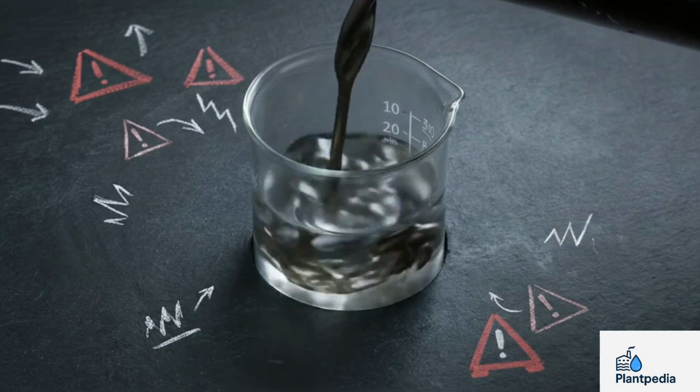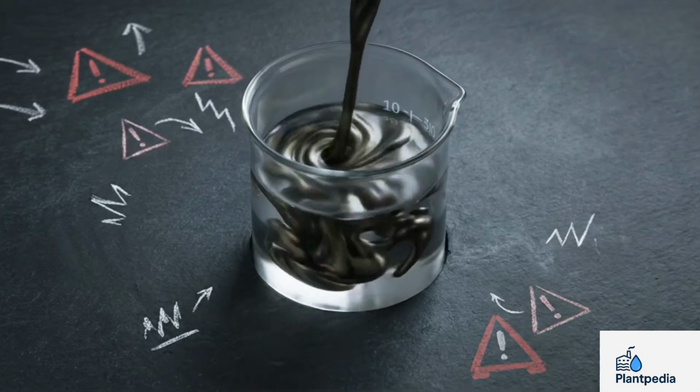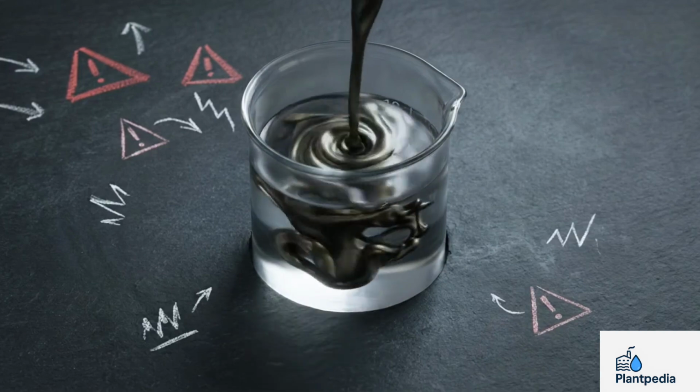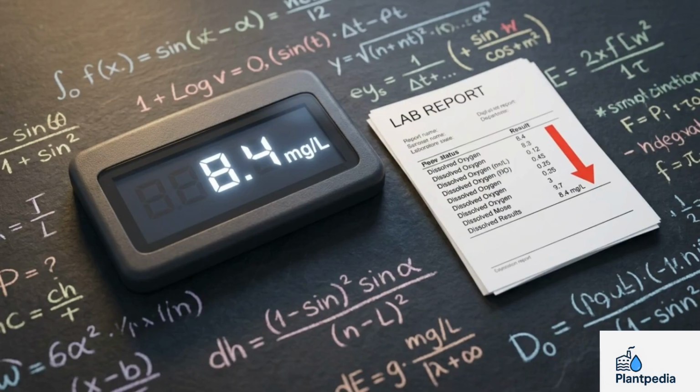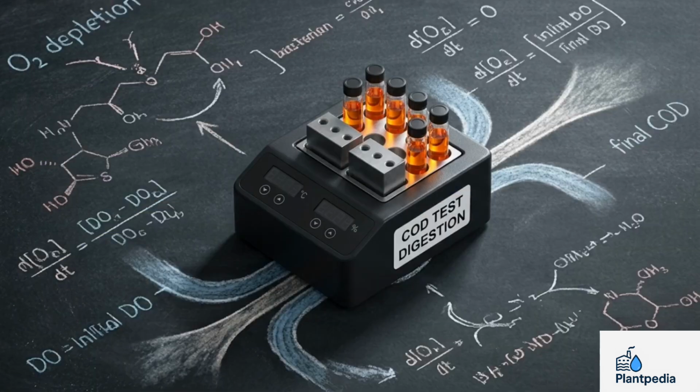You must watch out for toxicity. If heavy metals or toxic chemicals are present in the raw water, they will kill the aerobic bacteria. Dead bacteria cannot consume oxygen, which leaves you with a falsely high oxygen reading and an artificially low BOD result. If you suspect your wastewater contains non-biodegradable waste or heavy toxins, this protocol will not work. You will need to conduct a chemical oxygen demand test instead.